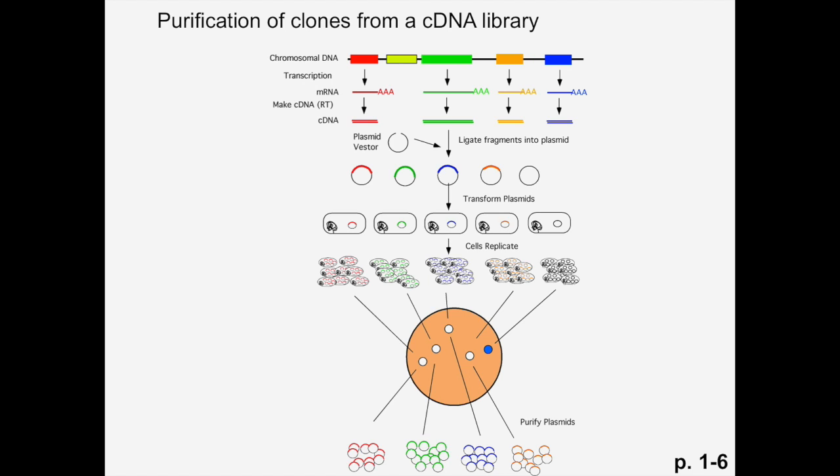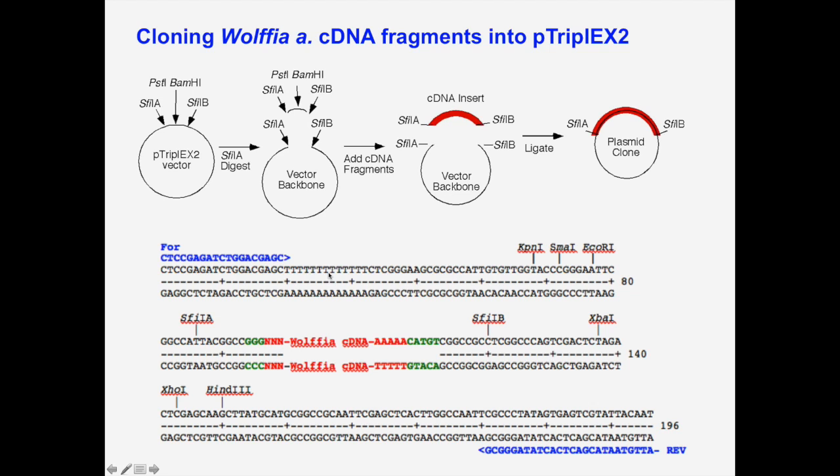So we're back to this picture here, and we're going to take a look at how to identify how large the insert is from the bacterial culture. If you remember, we did the PCR from the bacterial culture, so we're looking at the actual size of the insert at this point. And how can we determine that? Basically, in our plasmid, the gene has been inserted and ligated, and this area of the plasmid is going to be amplified so that we can see how large our insert is.